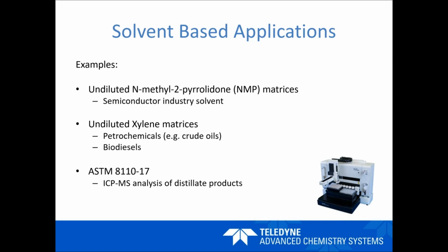And again, working with low volumes and low flow rates, you are potentially improving your limits of detection there, whilst not having to worry about what the sampled organic solvent is going to do to your system.